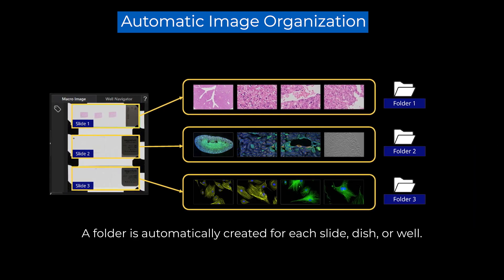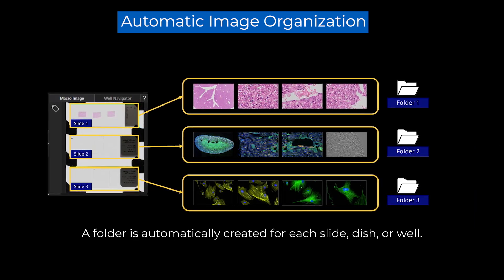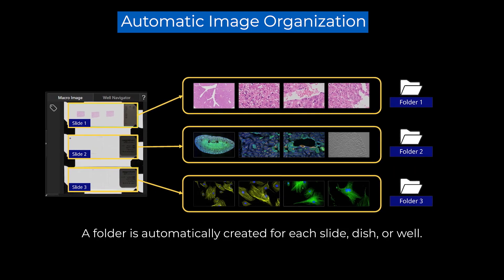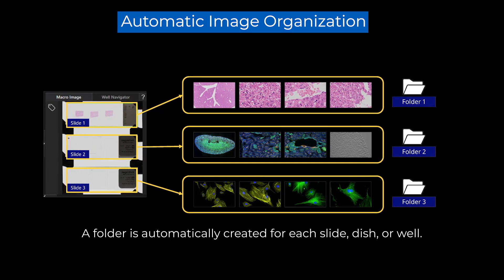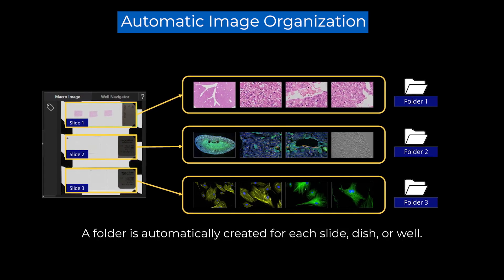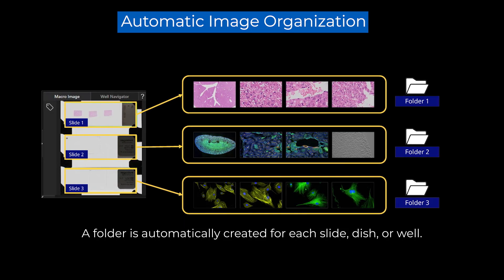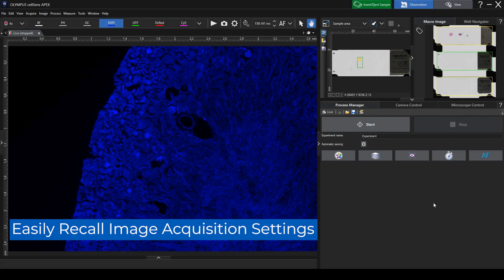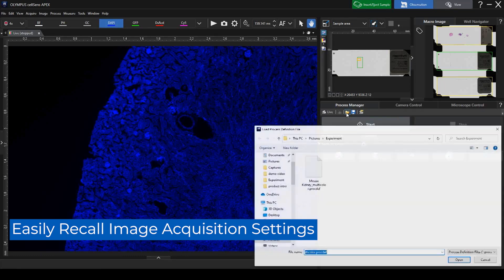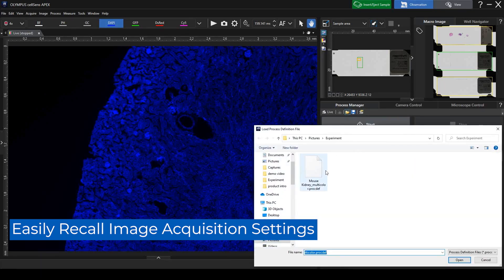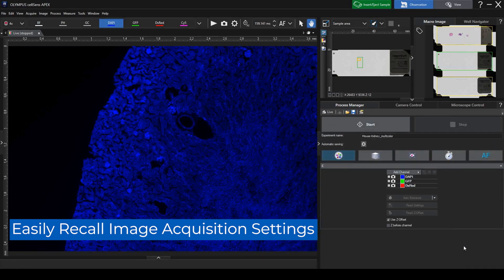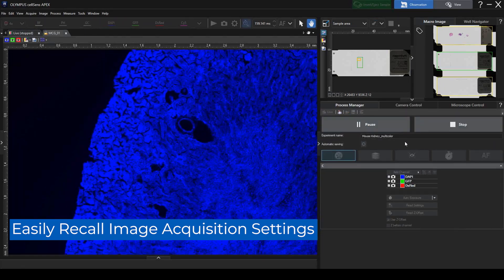This helps prevent data mix-ups and eliminates the need to search for past experiment data. The APX100 system also enables users to easily reproduce past image acquisition conditions, so that you can acquire accurate comparative data when conducting experiments.